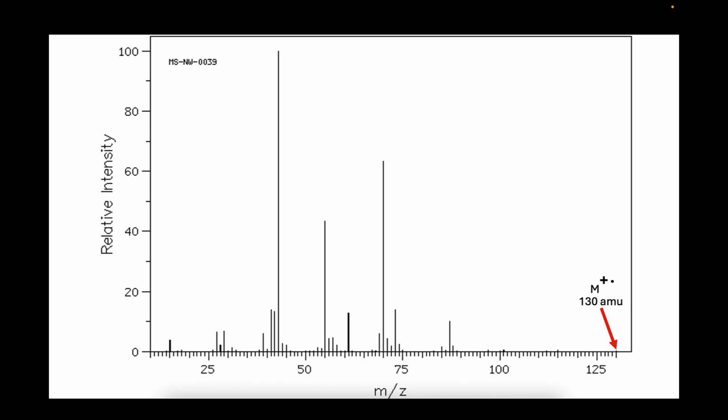Now, this isn't something that I expect you to figure out or know, and I won't give you an example like this on an exam, for example. But it does come up in real molecules, and if you're looking at a mass spectrum that has one of these molecular ions that is essentially invisible, I'll tell you where it is so that you don't get confused.